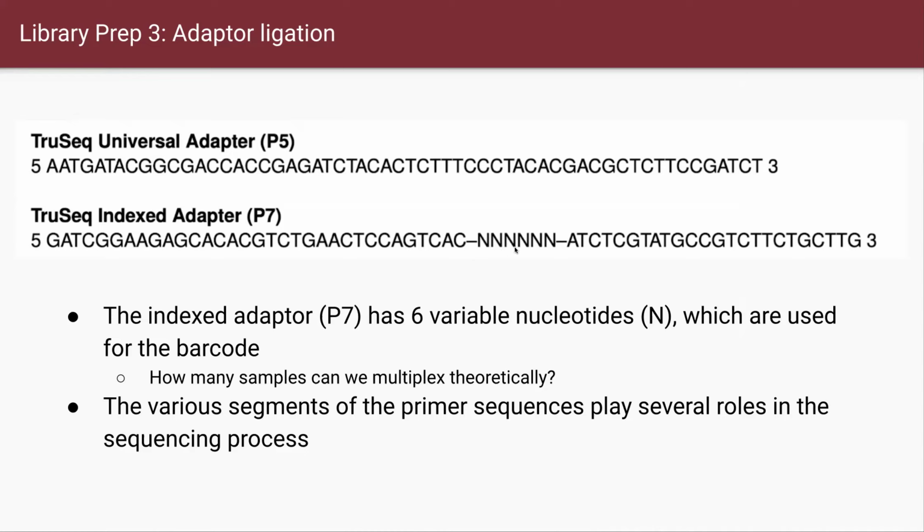So it's too many things, right? 4 to 6, right? So this multiplex approach using this barcode is super useful. Then you can affordably do the sequencing for high throughput situations. So that's why we use the index sequence.